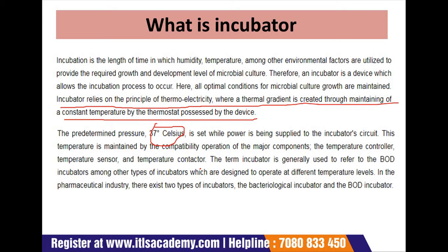The term incubator is generally used to refer to BOD incubators, among other types of incubators which are designed to operate at different temperature levels. In the pharmaceuticals industry, there exist two types of incubators, the bacteriological incubators and the BOD incubators.